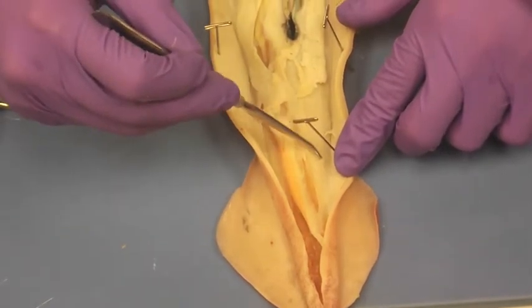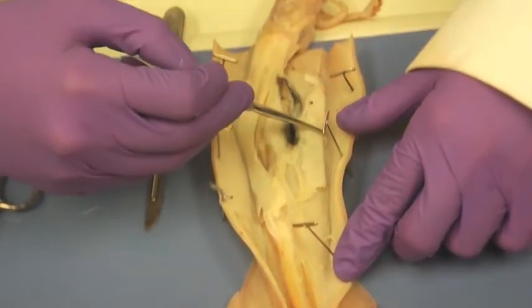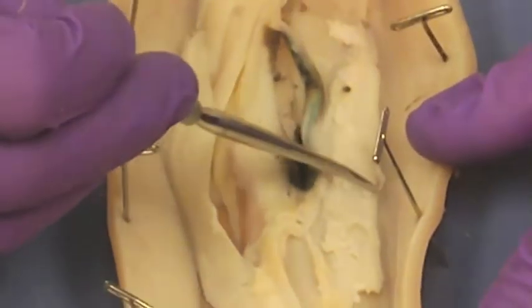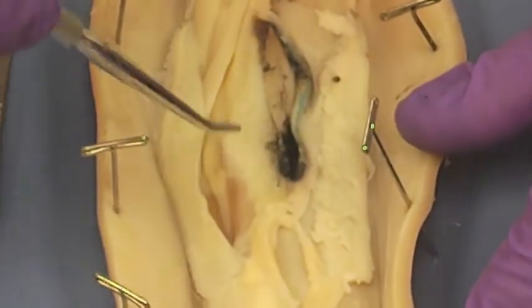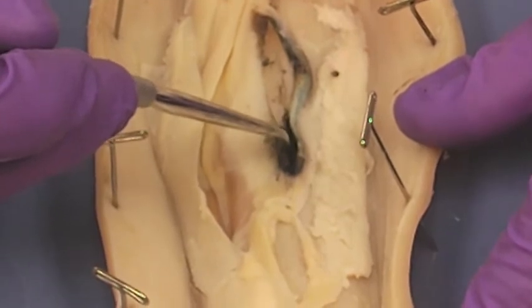Right where my pointer's at, that's where the gonads are. That's the gonad. This is the gills right there. That's where the gills are. And then lastly, obviously you can see the ink sack where that big black bulb is.